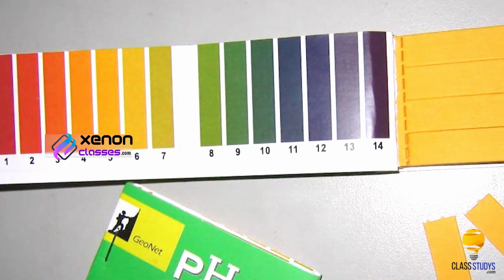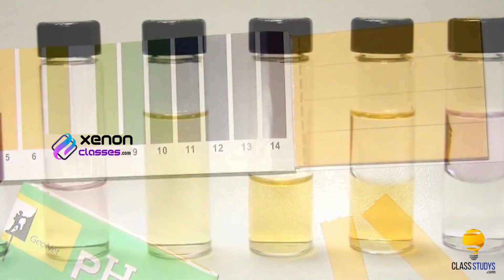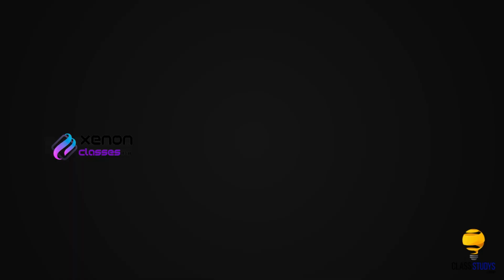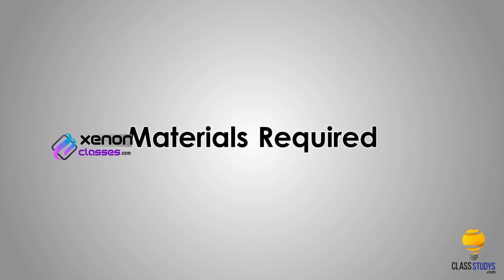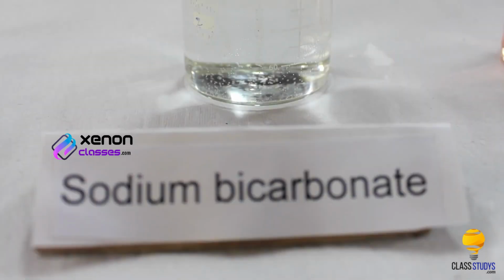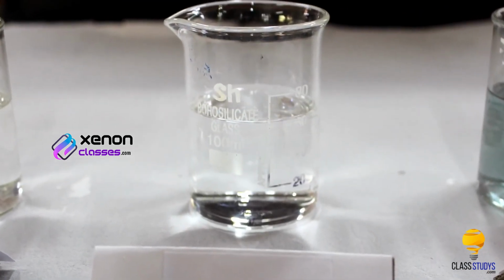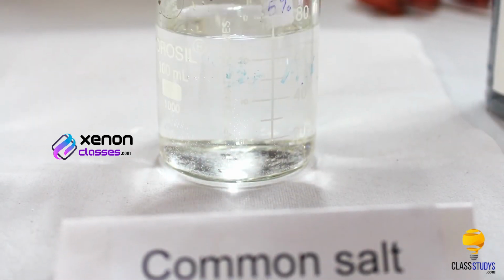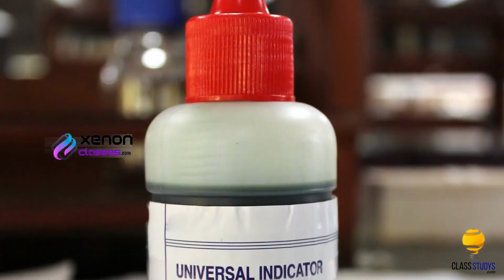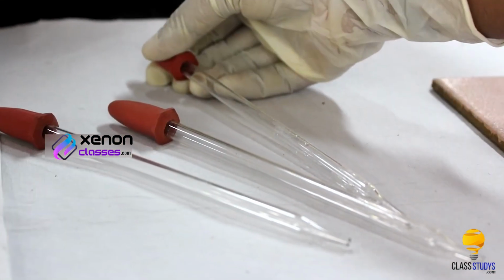Our aim here is to find the pH of given samples using pH paper and universal indicator solution. Materials required: solution of sodium bicarbonate, 0.1 molar HCl, common salt solution, pH paper, universal indicator solution, tile and dropper.